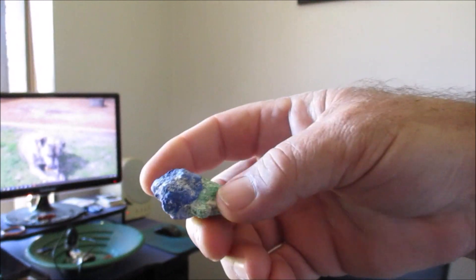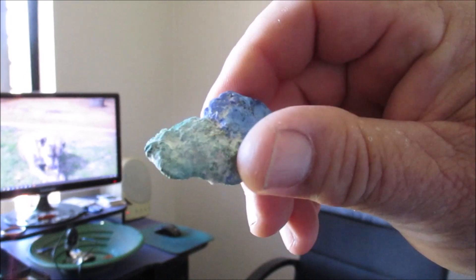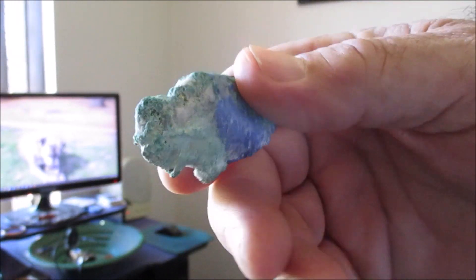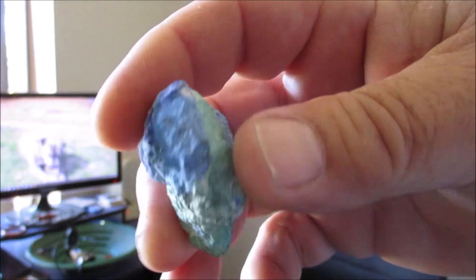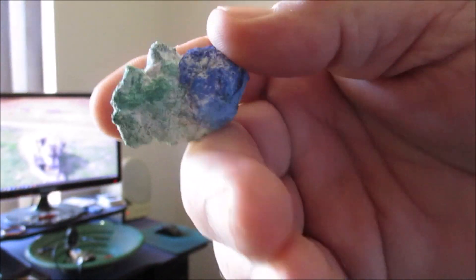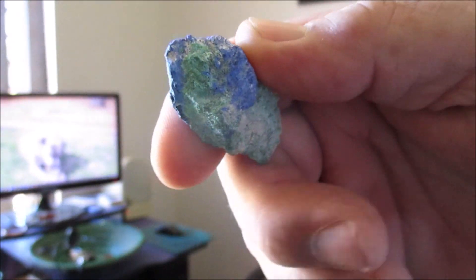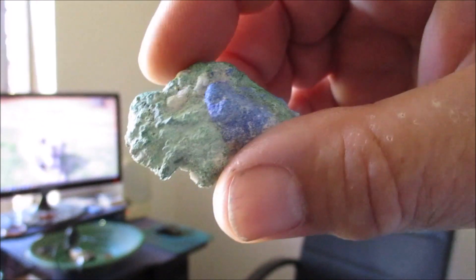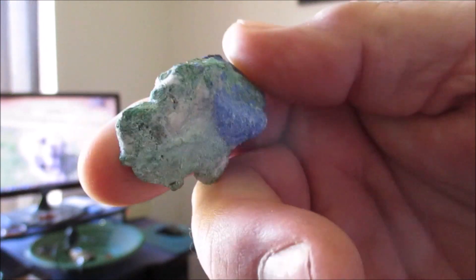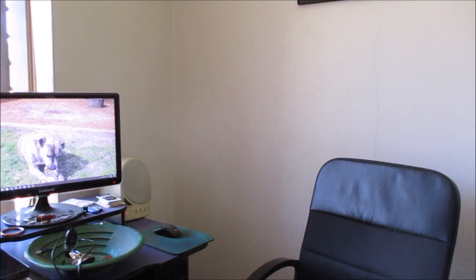The blue is azurite, the green is malachite — it's copper ore. But this stone is just full of gold, and it came from a mine not very far from here. I can't go out there and get any more; it's a mine lease and all the rest of it. But as you'll see on the video, it's just full of gold. Okay guys, I'll set the camera up and show you some of these stones.